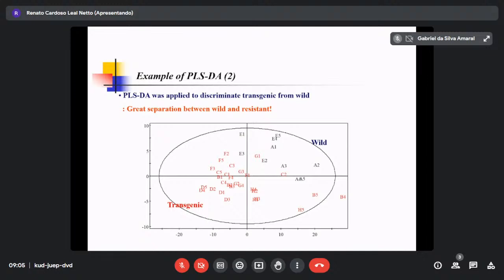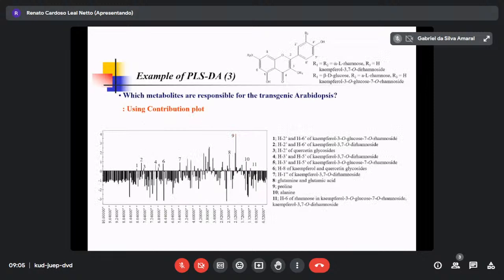For example, in LCMS, if I have 100 samples to analyze, I think about repeatability, considering the sampling, the preparation of my sample, and the equipment. What is better? Analyze 100 samples, or, for example, check the calibration every 20 samples? You can ask Peter to answer. There must be an answer. It depends on the instrument.